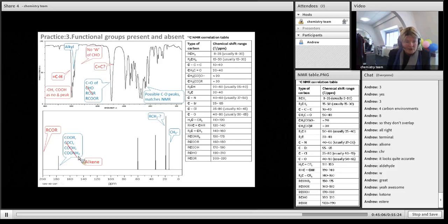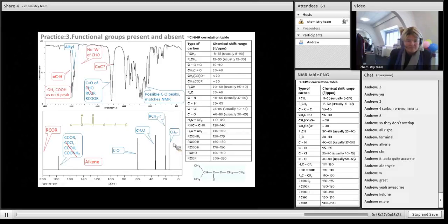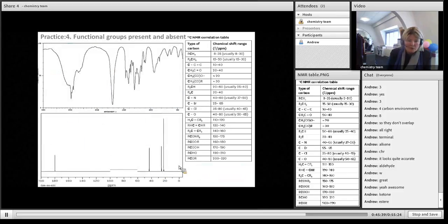So that's why we can cross those out there, reference it to the infrared. And yes, we are left with an ester. So we've got these two peaks. Remember, it will be the CO peak next to the ester, if I just show it. So number 2 is the one attached to the O, and number 3 is the one next to the carbonyl. And then we've got 1, 2, 3 methyl groups. So this peak over here is the methyl group, and number 4, those ones over there.